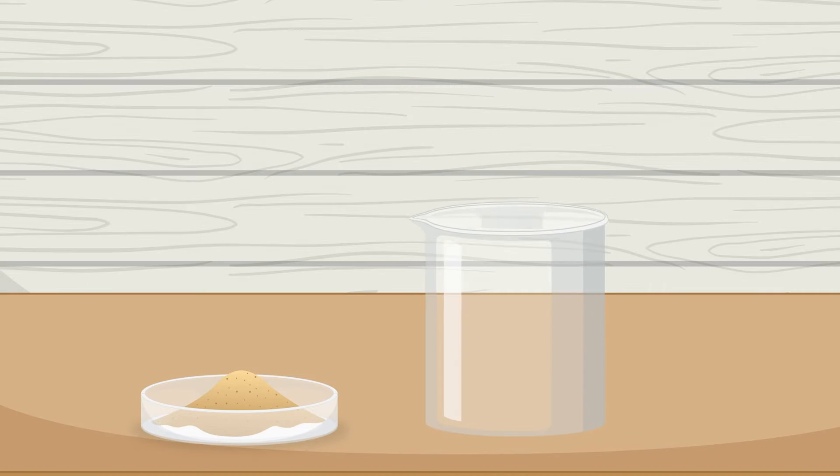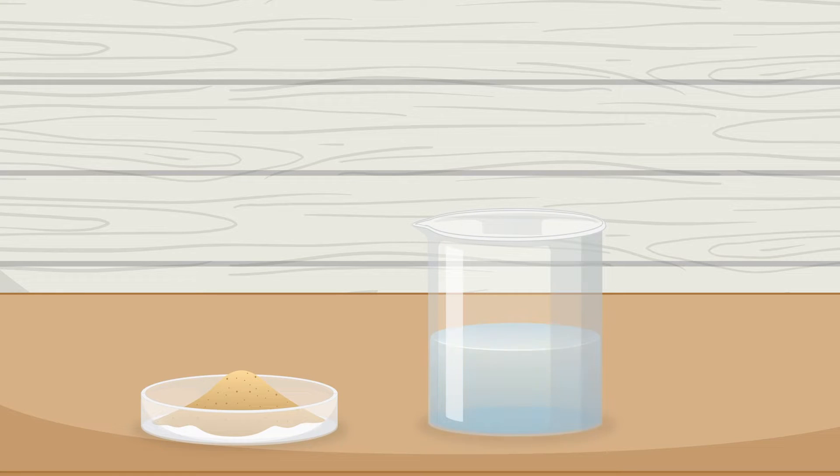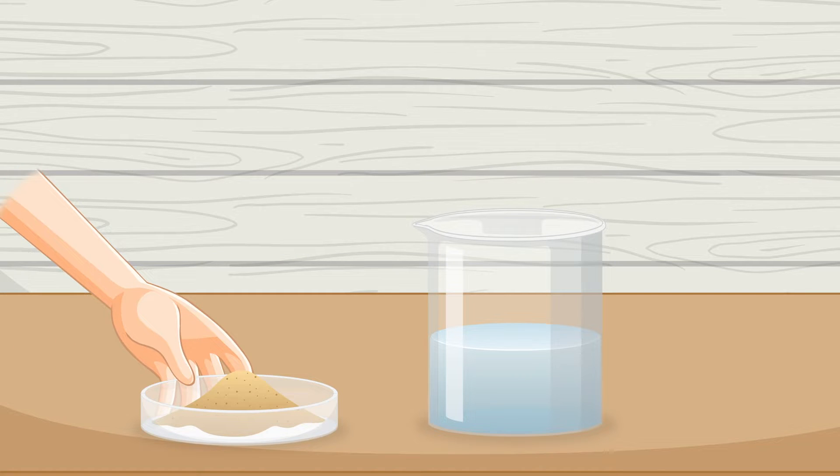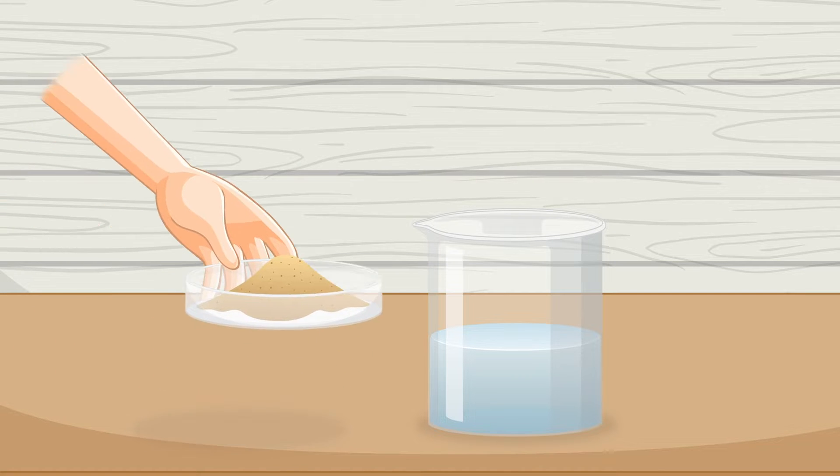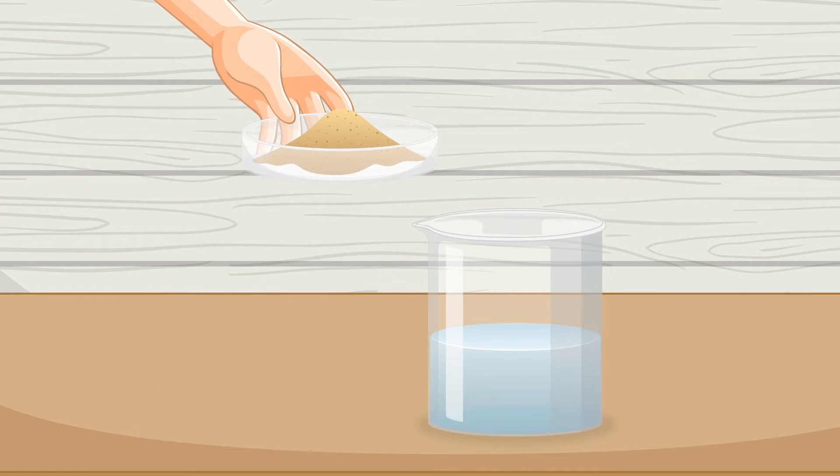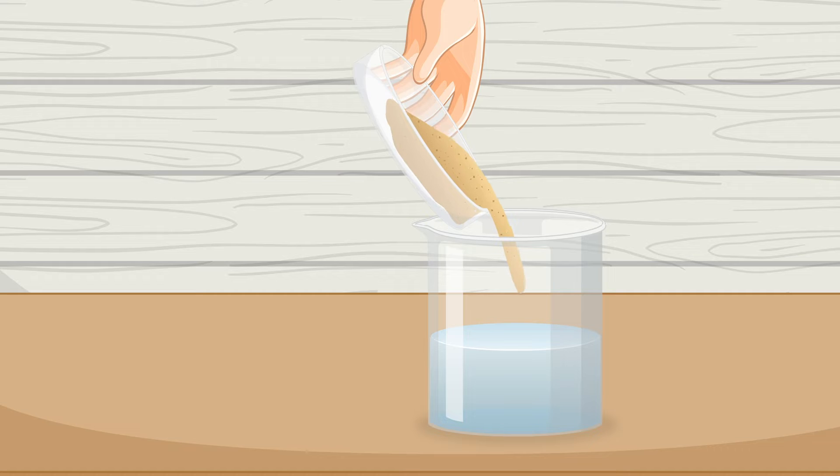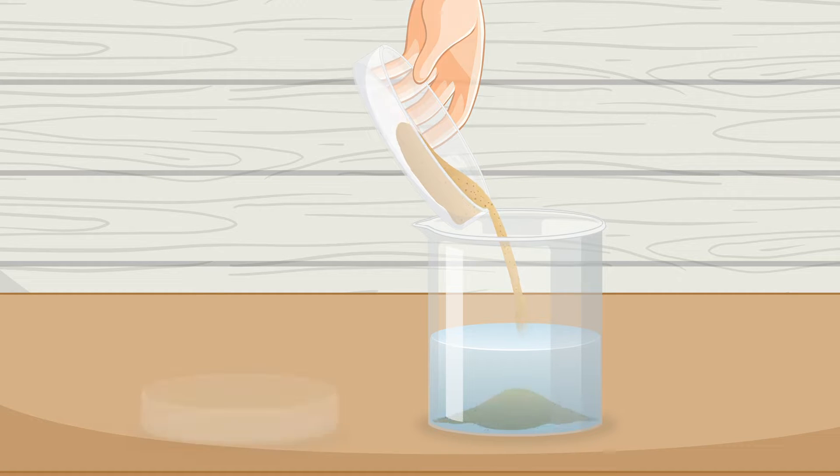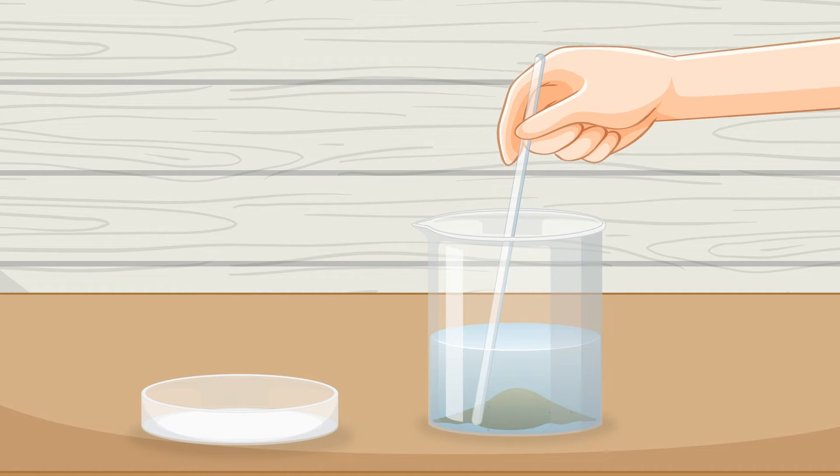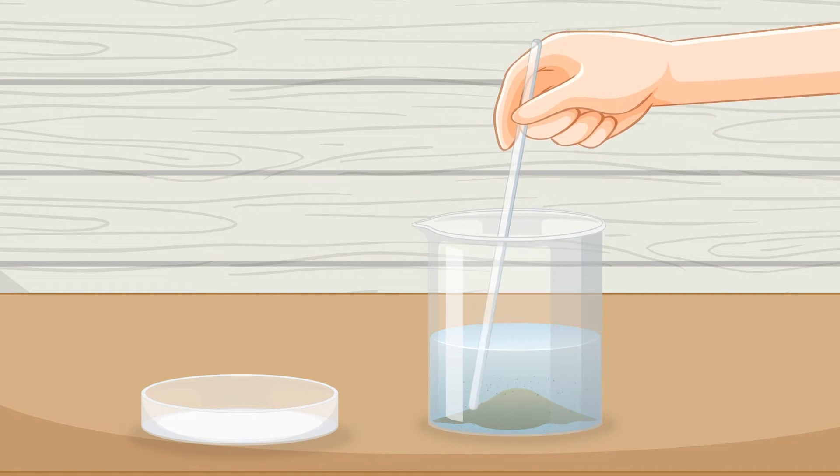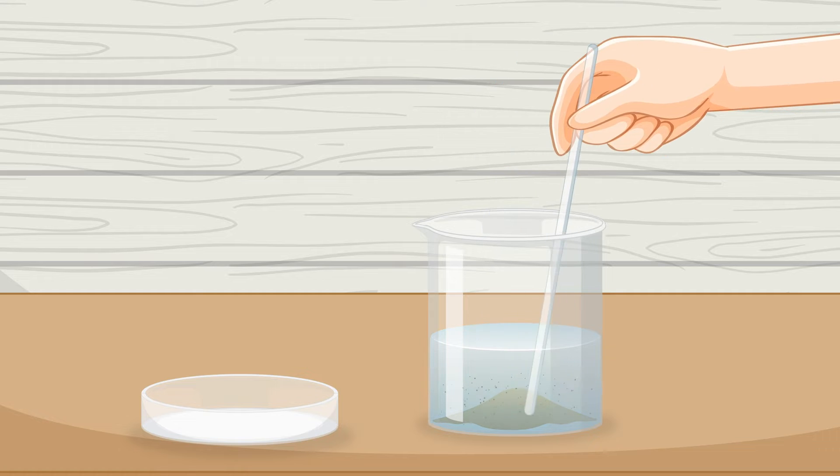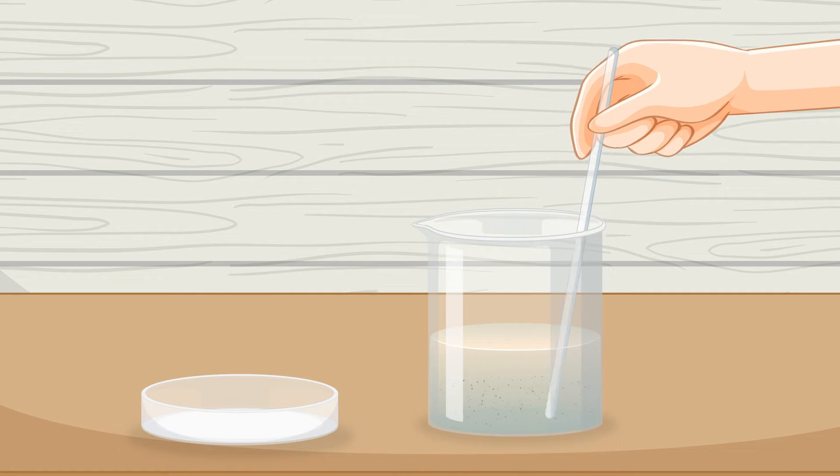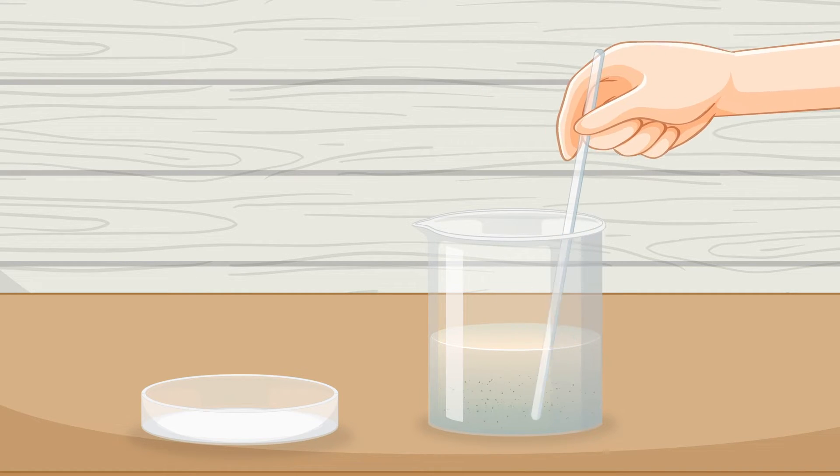Here we have a dish of sand and a beaker of water. Let's make a mixture by pouring the sand into the beaker and giving it a stir. Now we have a mixture of sand and water.